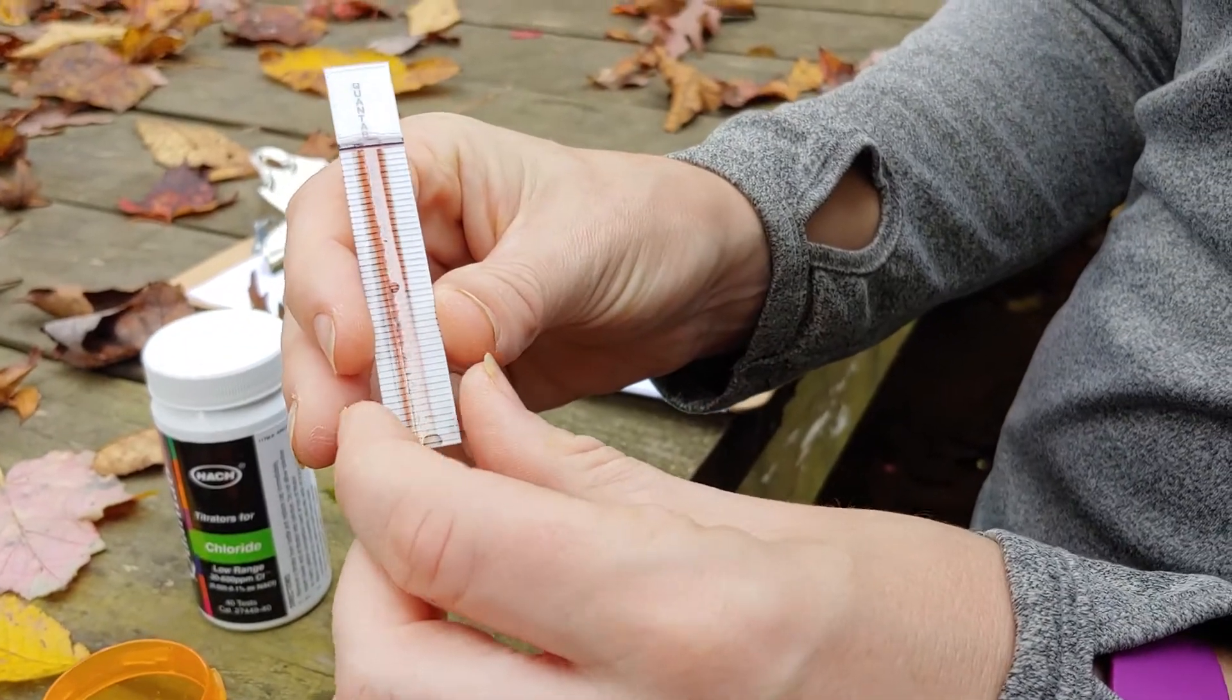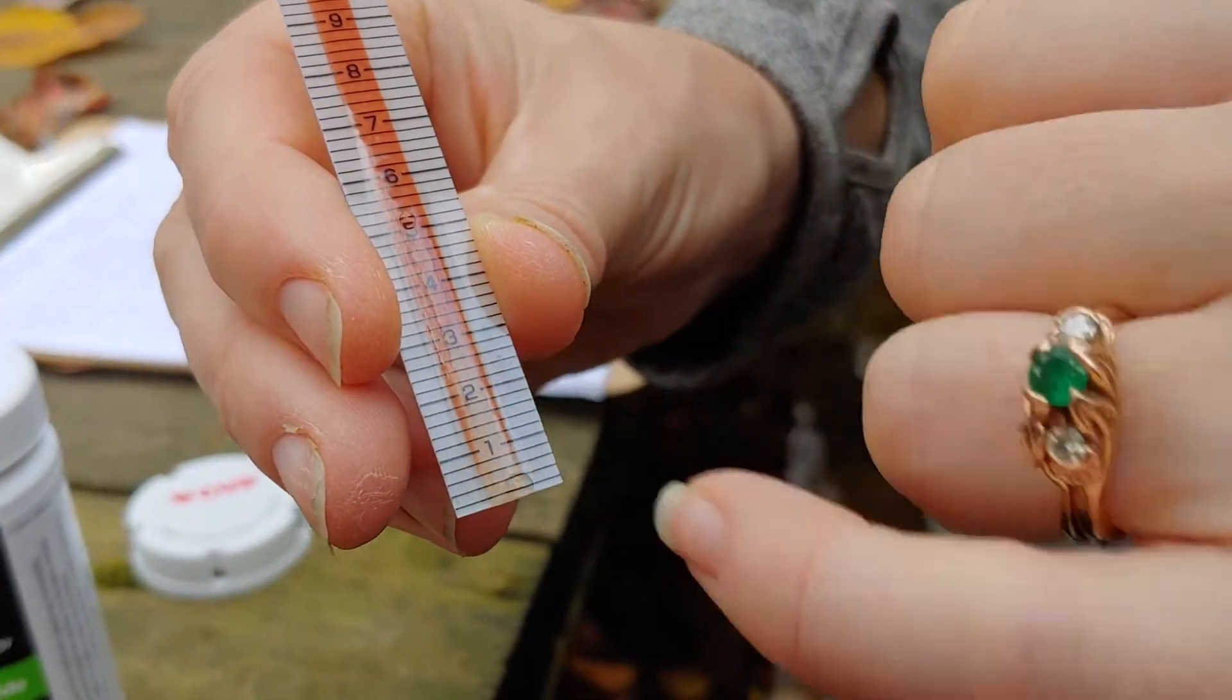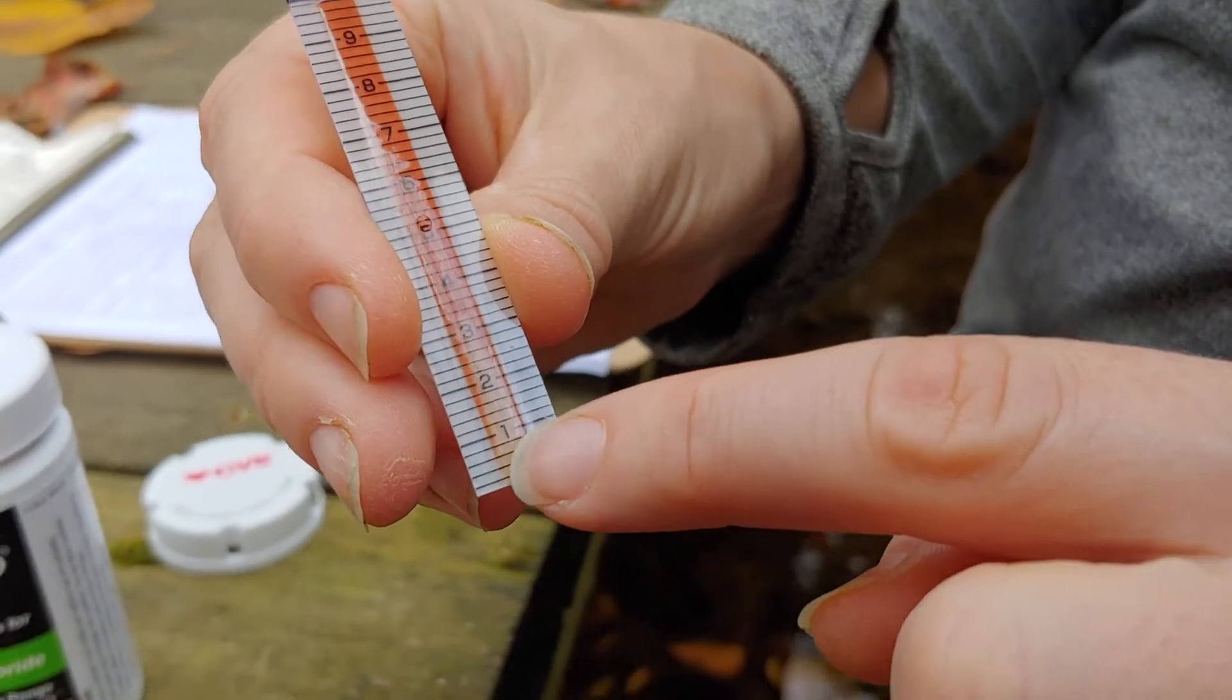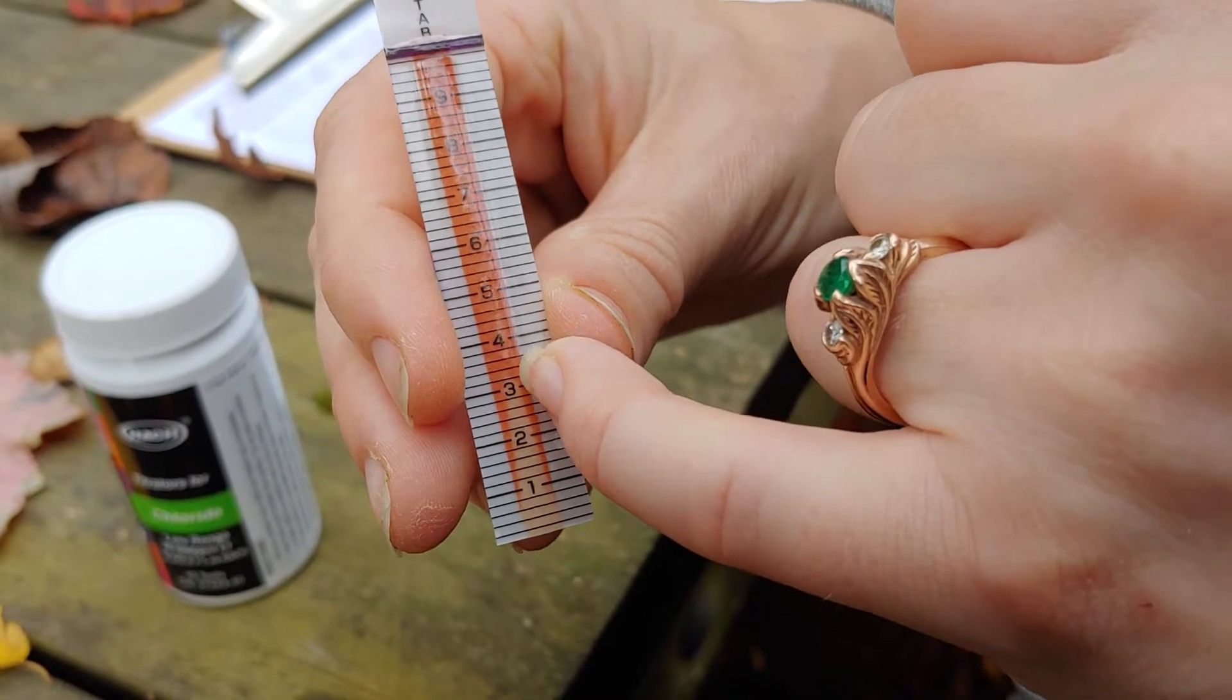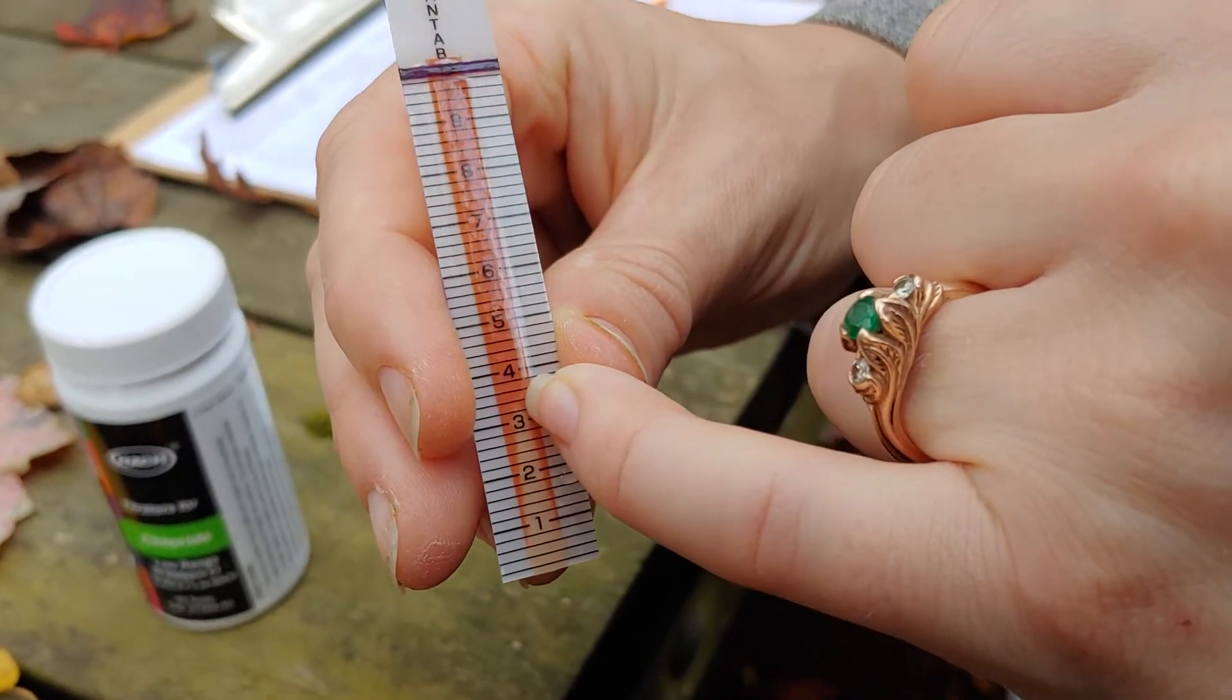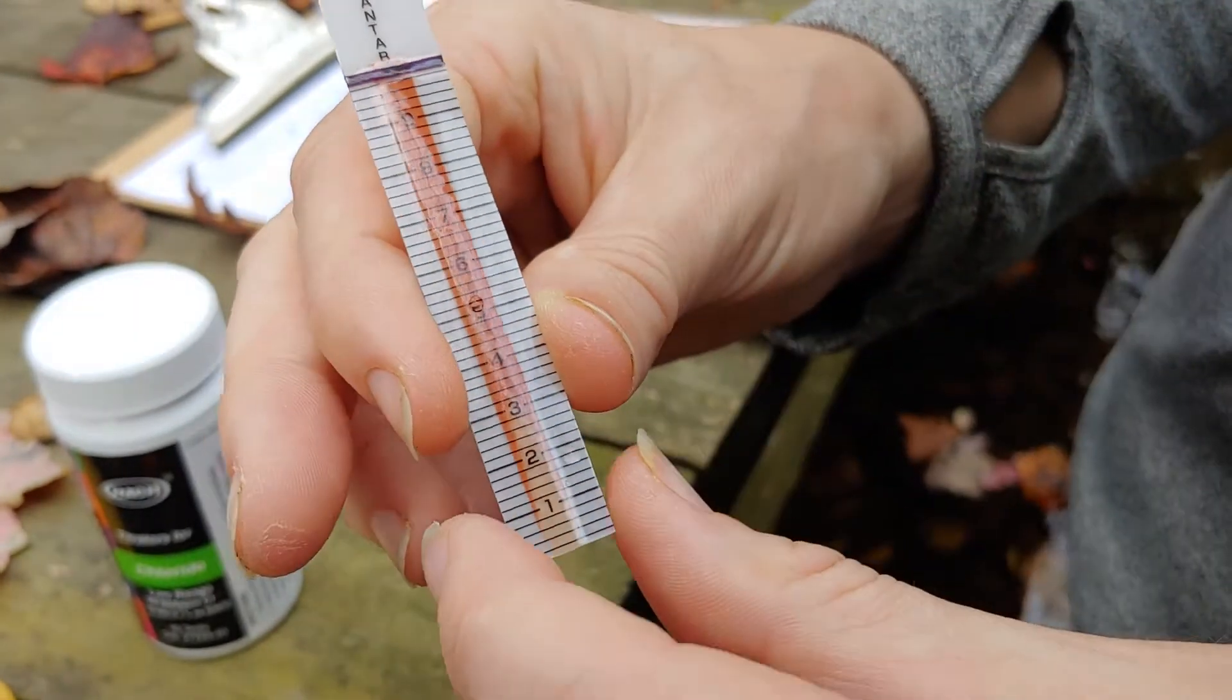So now it might be a little hard to see, but the bottom has changed colors. So there's this nice light yellow triangle coming up, and where that point ends is what our reading is going to be. So it looks like it's ending right about at 3.2.